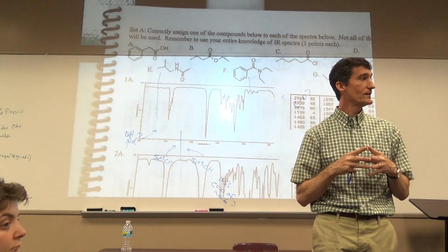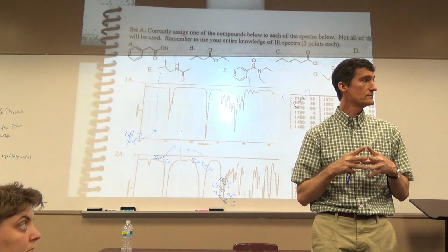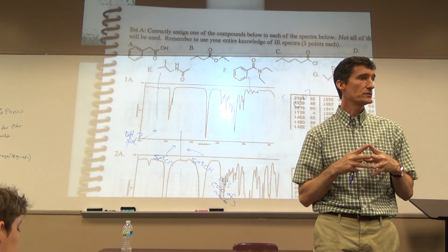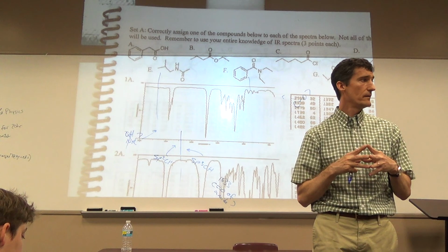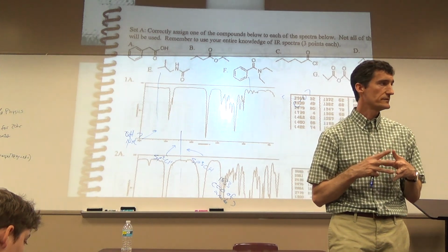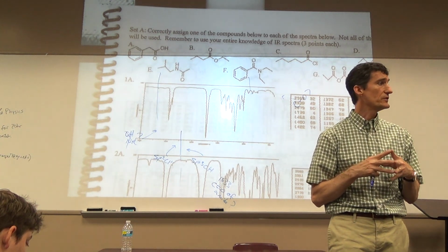Now, is there anything we would expect different, I think you might have covered that, the sp2 NH versus the sp3 NH? I mean, the sp2 NH is probably going to be stronger as far as peak intensity, but peak position, they're both NHs. The sp2 NH is stronger, like in your amides and your anilines.